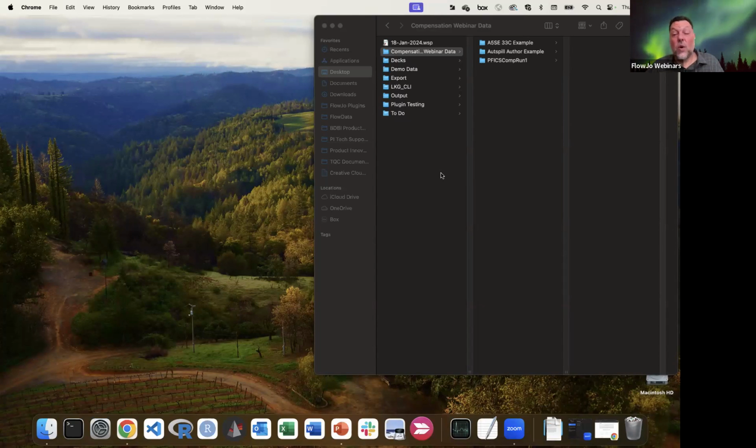It just takes a little while to set up in FlowJo, right? If you do it correctly on the instrument, defining your positives and negatives and doing the spectral unmixing, that's great. You can also export as unmixed, then apply a compensation matrix of zeros in FlowJo and edit the interactions one-to-one using that matrix. So I think it'll make more sense when we get into some of these demos.